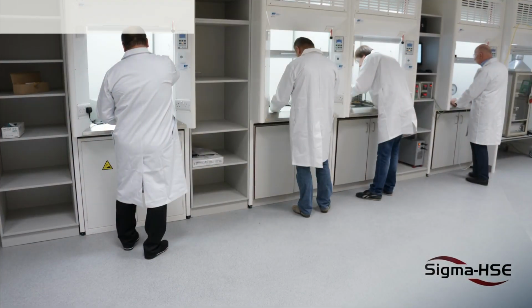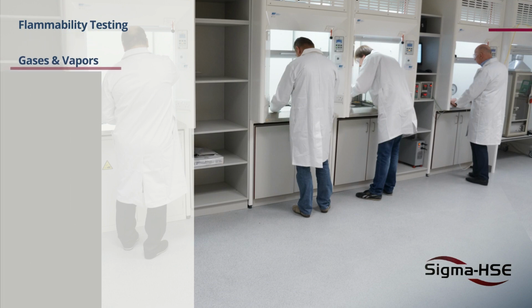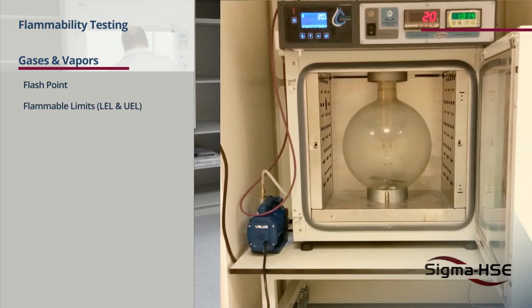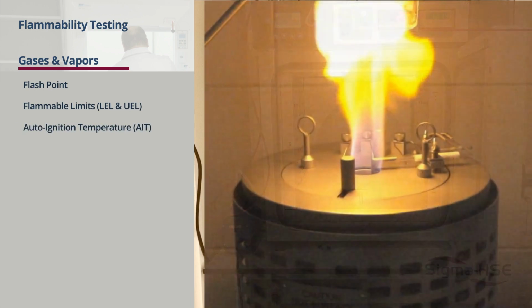We undertake the following flammability tests for gases and vapors. Flashpoint. Flammable limits, LEL and UEL. Auto ignition temperature, AIT.